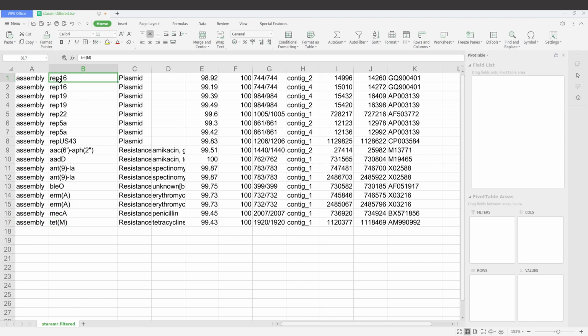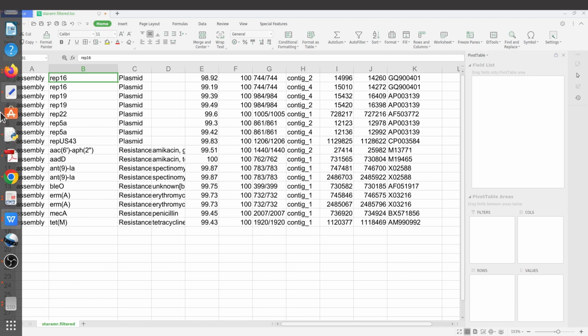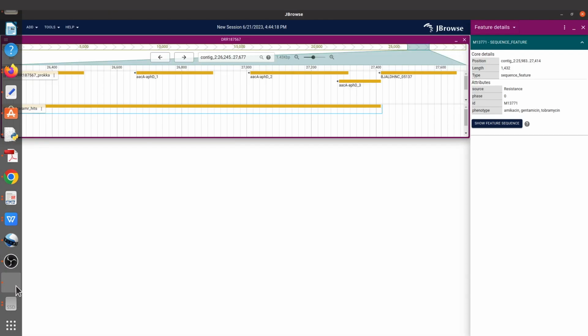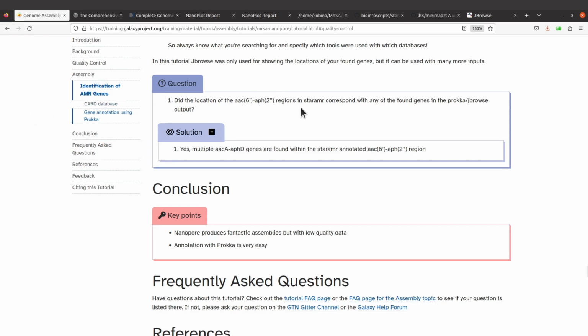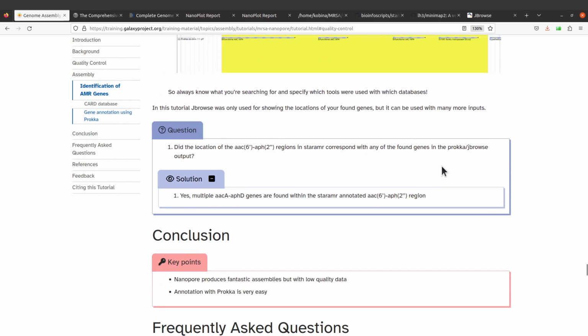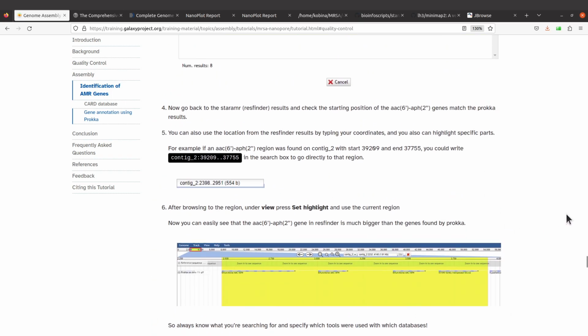All right, so you can also do it for the plasmids also to see where they are, but that's something that I would like you to try and then give me feedback. All right, so these are cool things that you can do if you know your way around bioinformatics. So of course, this is a bacterial genome, and so it makes sense that we do all these things to visualize and you'll be able to understand the organism better with respect to the genes of interest or the features of interest or the genomes or the sequence that we are interested in. All right, so these are things you can also do.